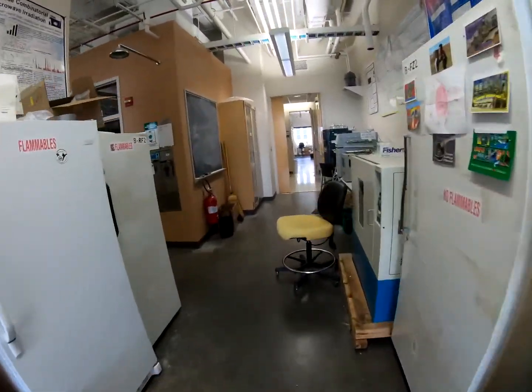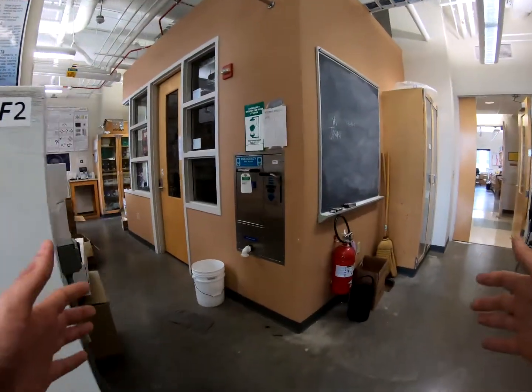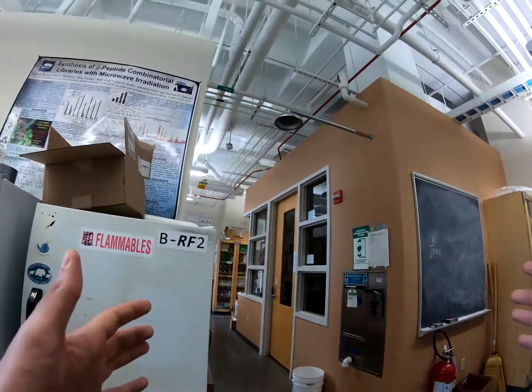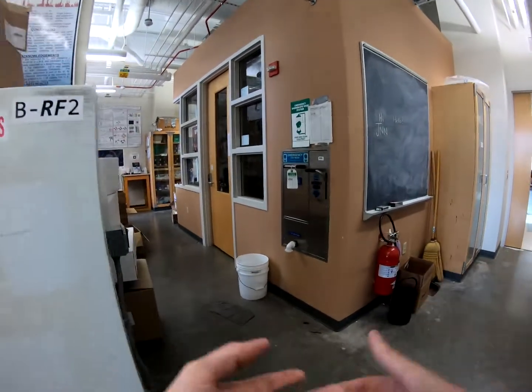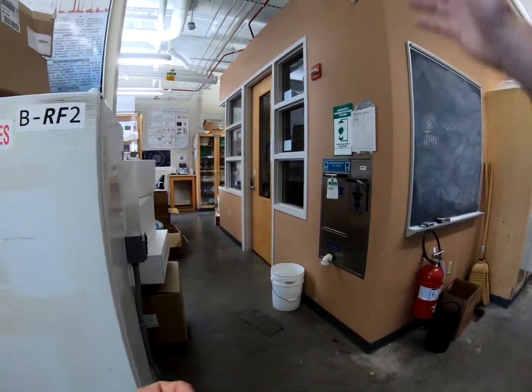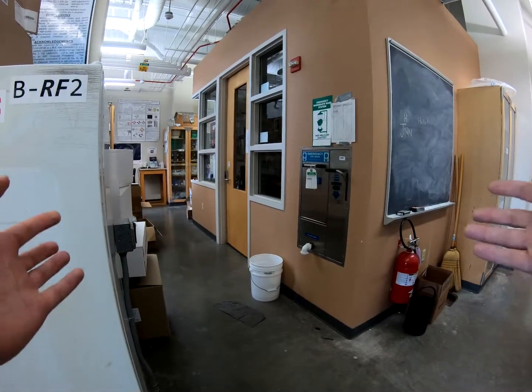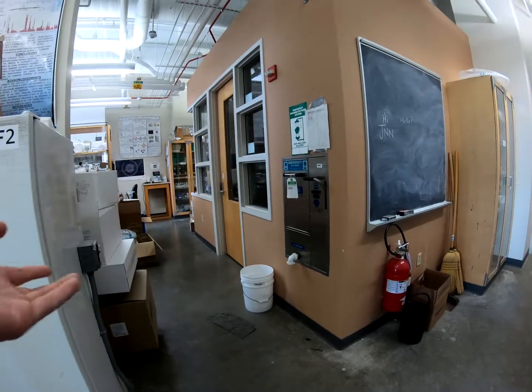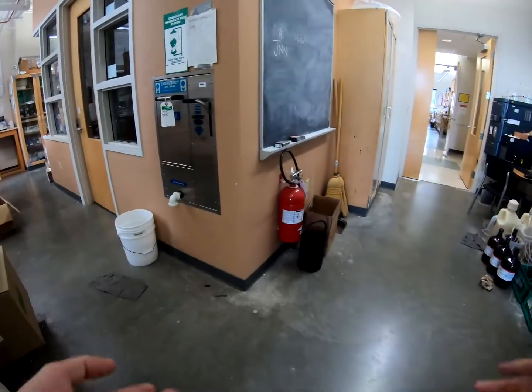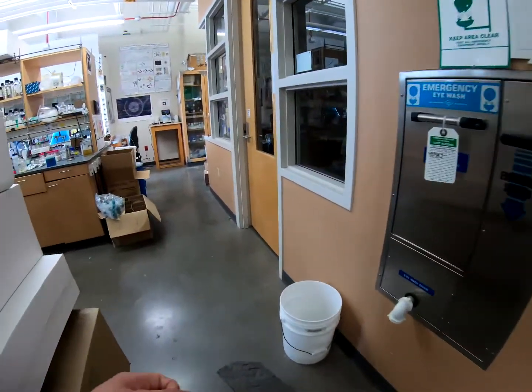All right, and as we come across into this corner here, we see our safety shower and our eye wash station. So if you ever get exposed to a chemical, or get anything in your eyes, it's located right here. And all of our labs have these in a similar location as Lab B, and one of our fire extinguishers is located here.